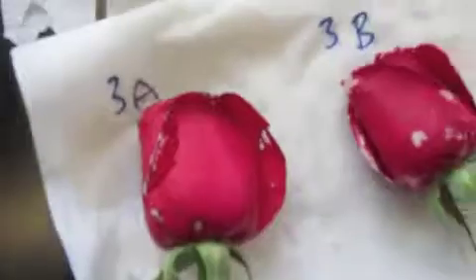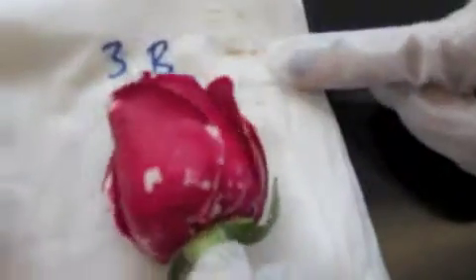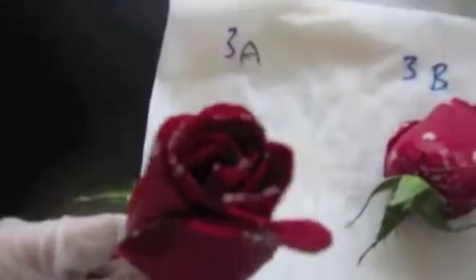And if we look at the ones kept in for 20 minutes, compared to the others, this one, put in H2O2, has the most white spots out of all of them. We can conclude that this means that the most color has been taken out, which means hydrogen peroxide is more reactive compared to household bleach, which only has a few white stains and a little bit of black.